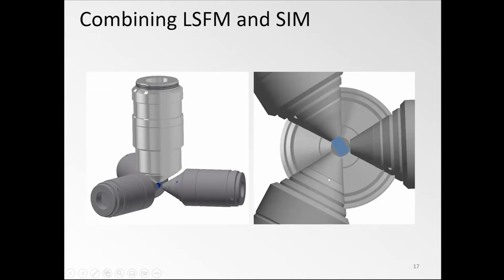And if they're oriented by 120 degrees, we could essentially get those 3 directions that we have discussed before that would yield a uniformly or isotropically extended OTF, optical transfer function, and as such also uniformly improved spatial resolution. However, this would be quite a monstrous microscope, because you would have to build 3 lattice light sheet microscopes and weld them together and do that quite precisely.